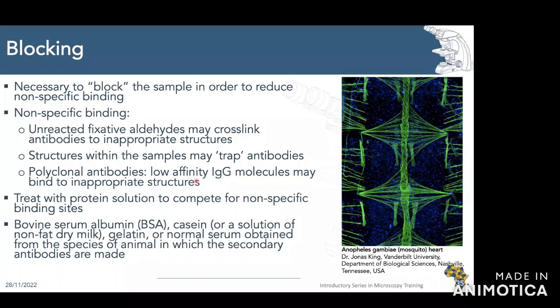So please don't forget your blocking buffer. It's usually done for an hour at room temperature, and then you would make up your primary antibody in a blocking buffer, the same blocking buffer.